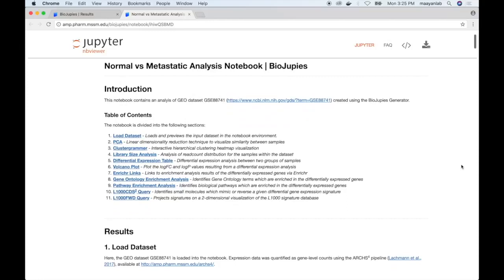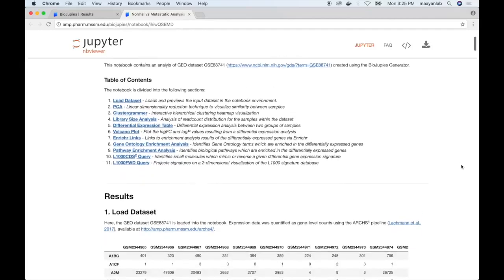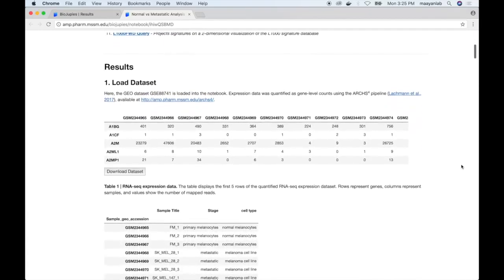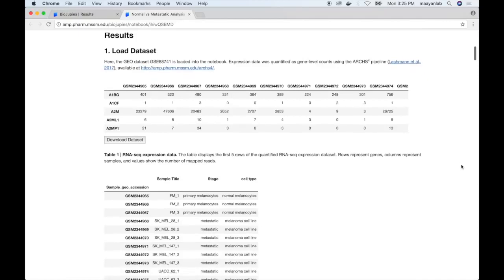The first section of the notebook contains a brief introduction, as well as a table of contents showing the different sections contained in the notebook. We then have a results section, which contains the results of the analysis itself.